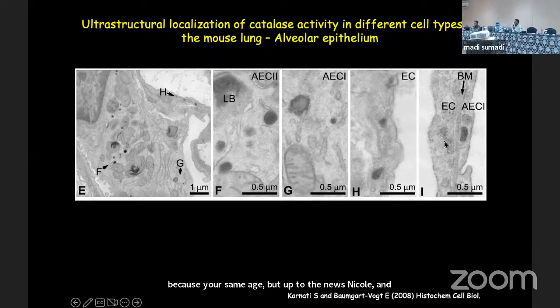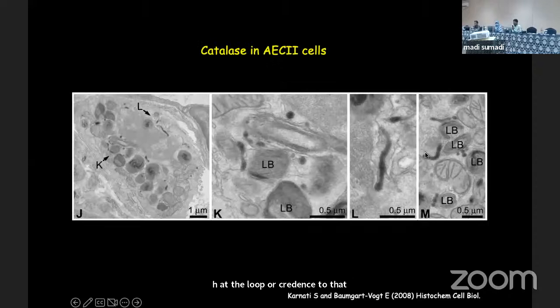In a similar way, these peroxisomes also have an age, and they live for 3 days. So on the third day they die and a new one comes. You can see this is a typical pattern of a peroxisome having a head and a tail. And this is actually how the peroxisomes are in the cells. But what you see here, and why do you see only round here?